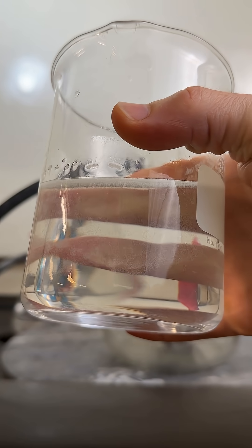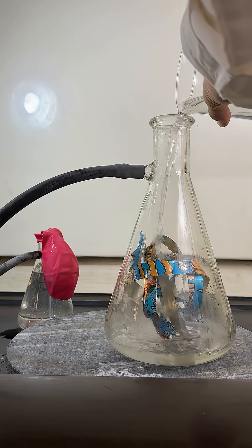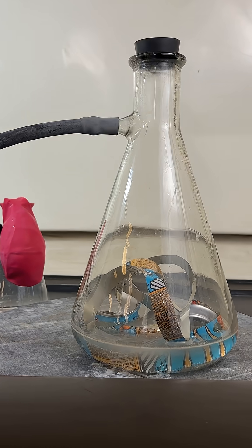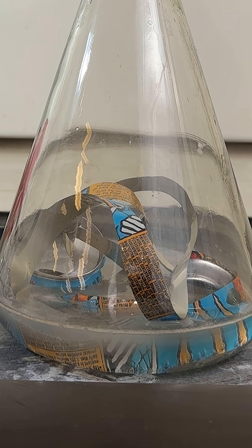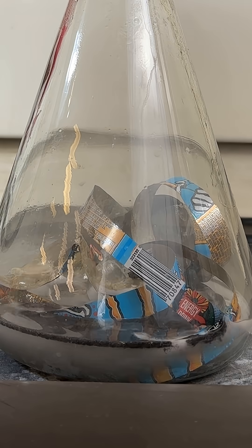Next I added this absurdly concentrated sodium hydroxide solution, which would make the aluminum react insanely fast, and corked it. The reaction went absurdly slow so I'll speed it up for you. The reason for this is the can has a coating on it and mainly reacts on the edges where it was cut.